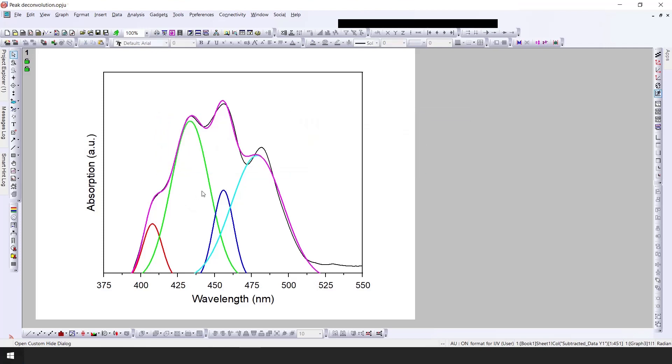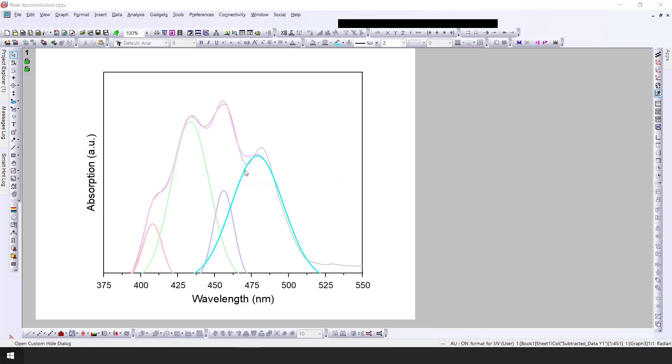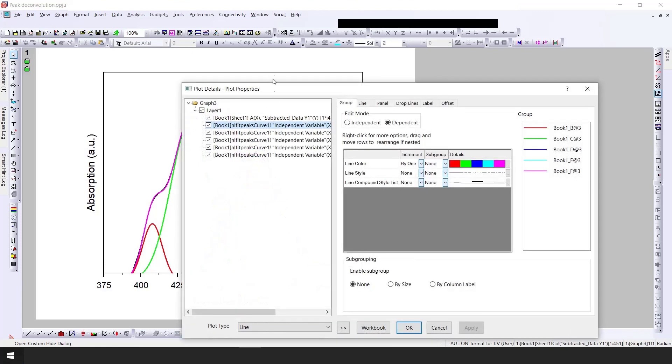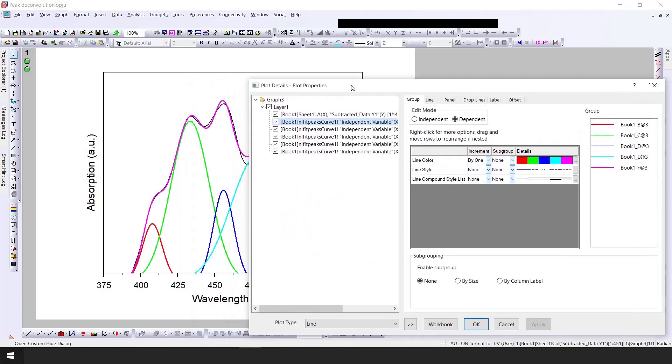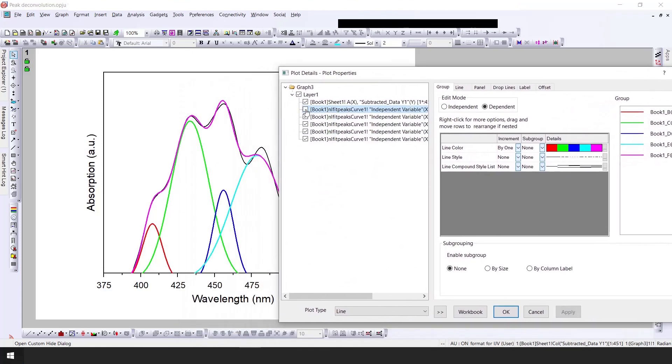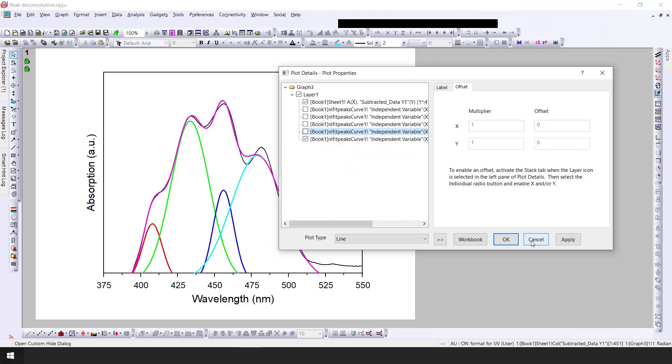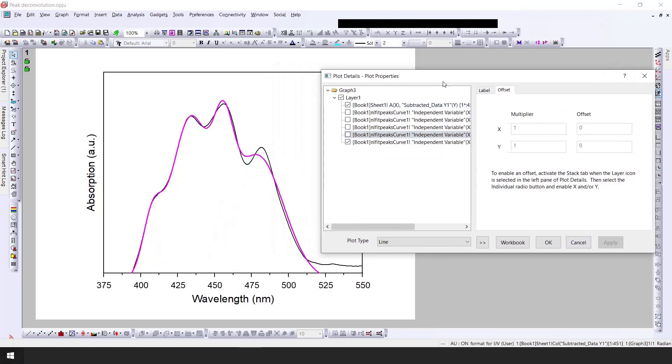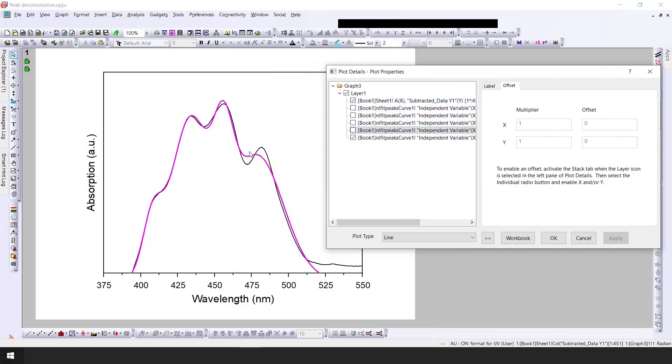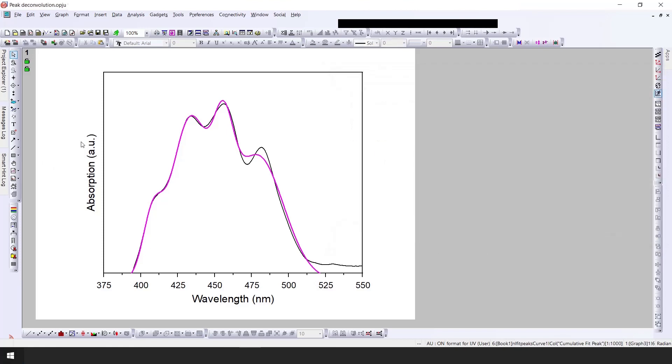We successfully deconvoluted the peak into four different peaks. If I click on one peak, I will just untick all the peaks except one. This one is the cumulative peak of the four peaks. If I apply, you can see here the black one is our original one and this pink one is the cumulative peaks of all four deconvoluted peaks.